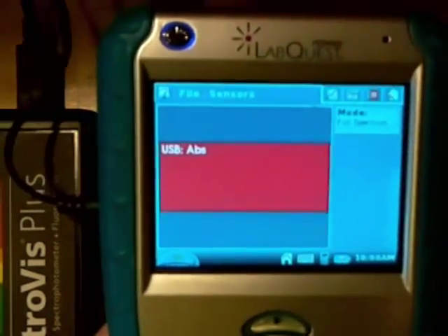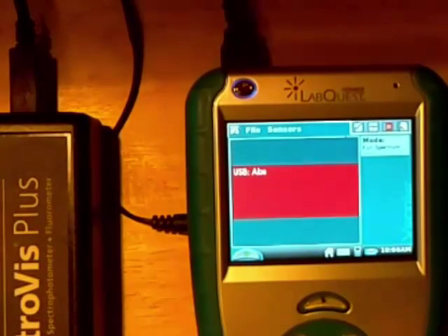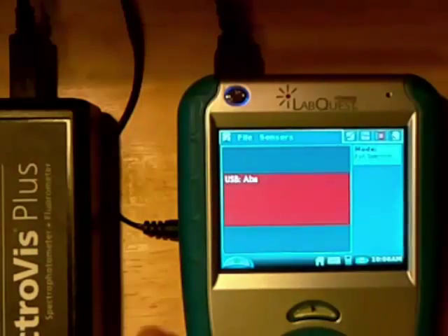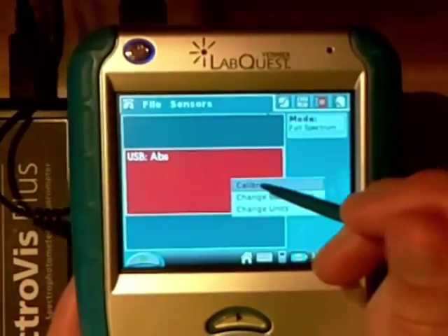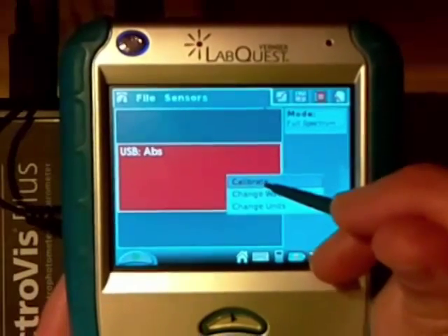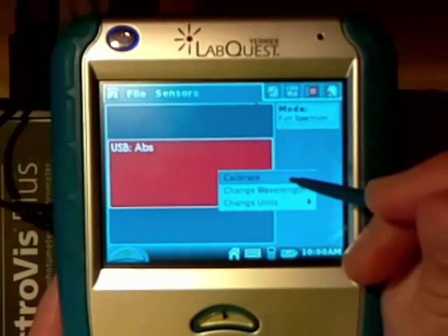Now there are a couple of things we need to do first. We need to calibrate our spectrometer. I'm going to take the stylus and click on the red area — up comes calibrate, change wavelength, and change units. I'm going to click on calibrate.